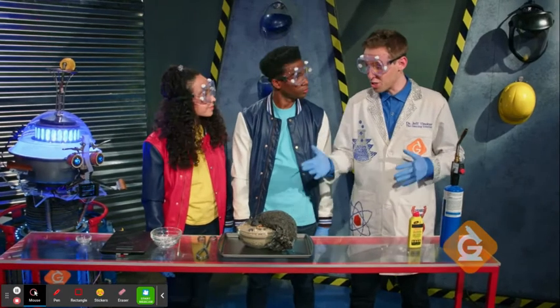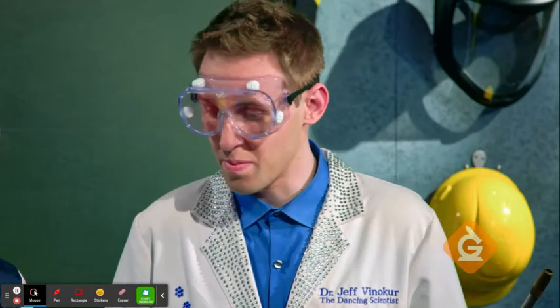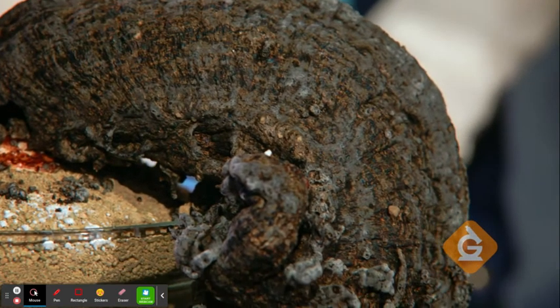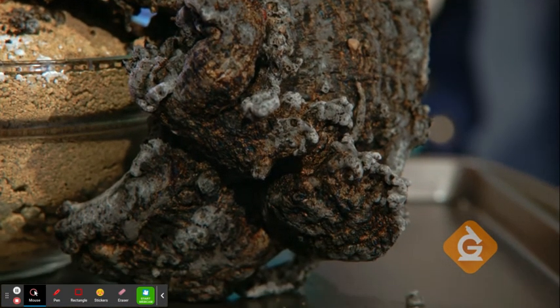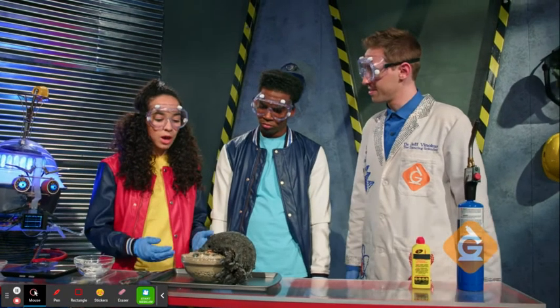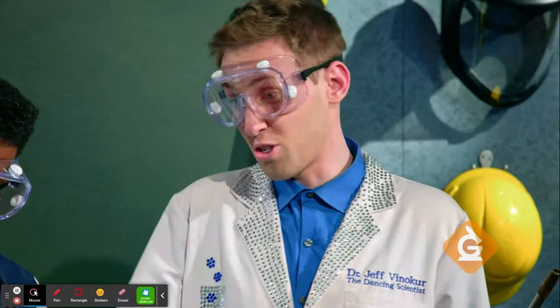It looks like a snake just grew out of nothing, but all it was doing was foaming. Burning this mixture creates a lot of carbon dioxide gas. All the bubbles make it appear really big. So where did all this stuff come from? Remember, the law of conservation of matter tells us that when matter changes form, it's conserved. So, when you take out all the gas bubbles, it should weigh about the same as the stuff we started with. Let's try it out.